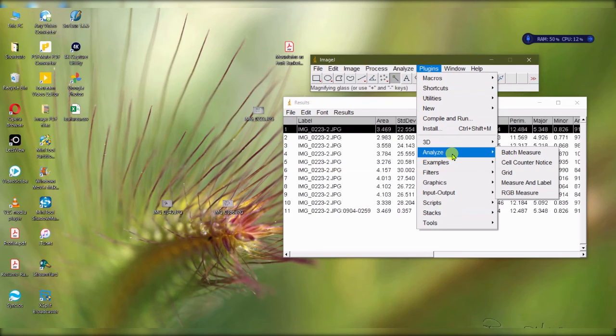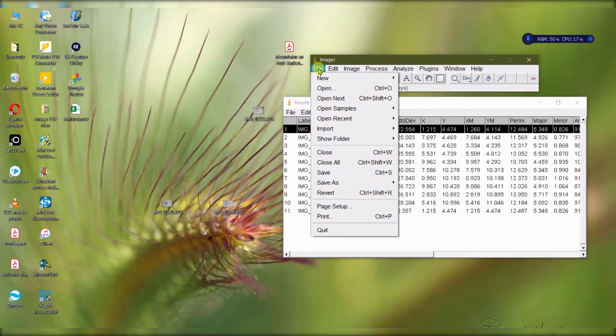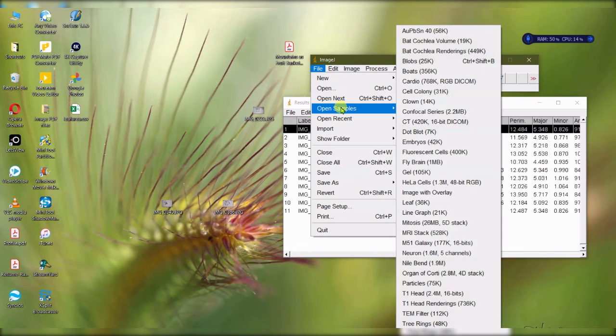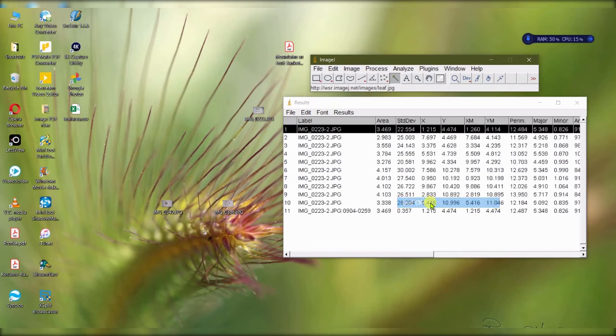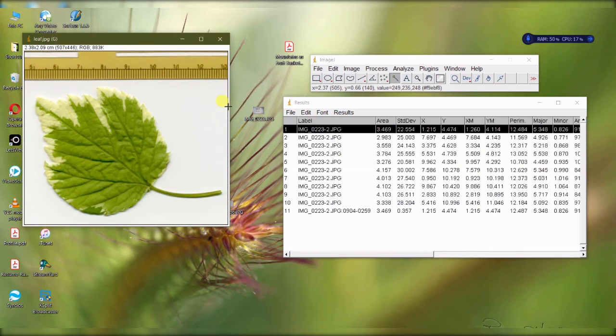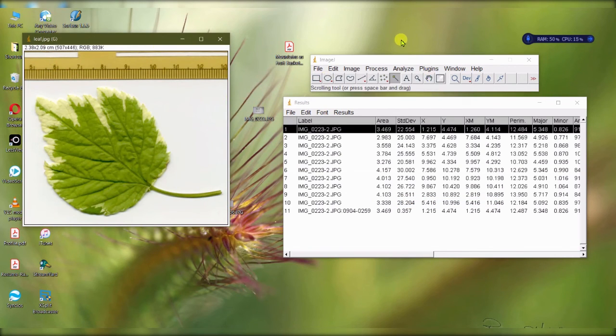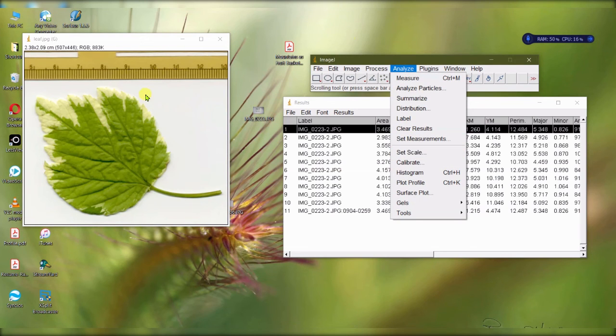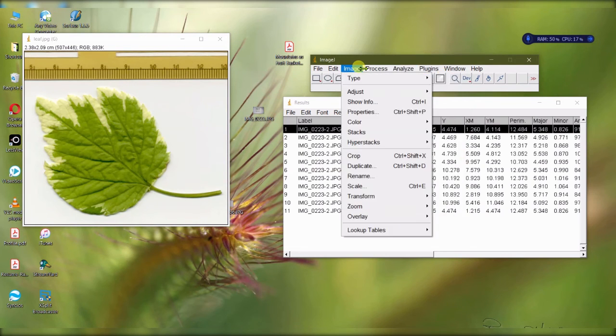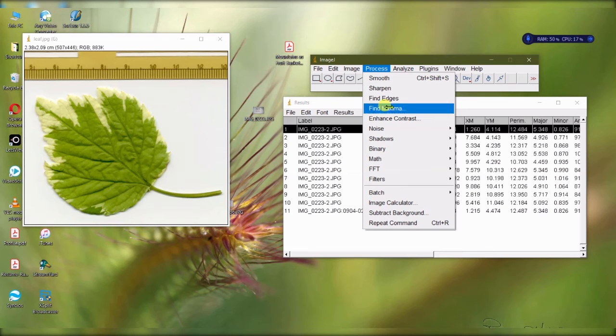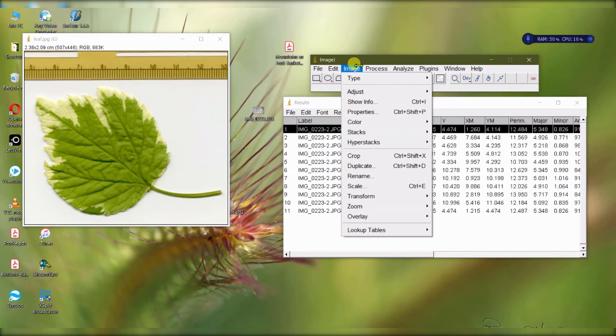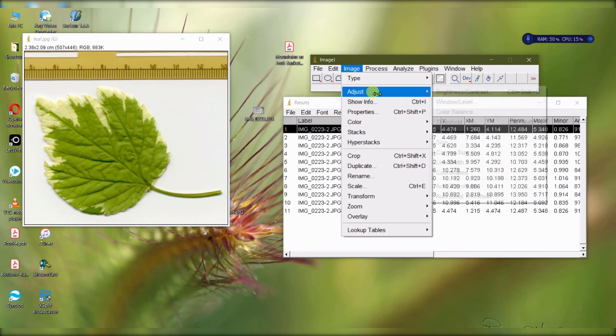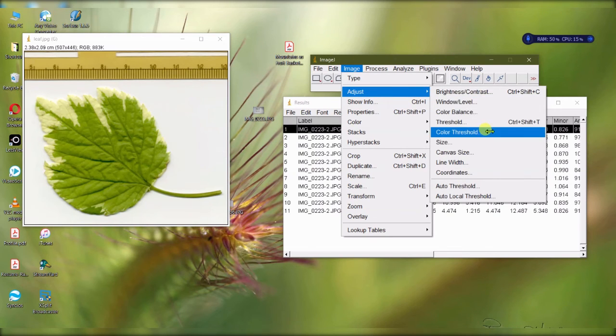I hope this was useful to you. Try it on your own. As I mentioned, ImageJ comes with its own samples. Try it on the leaves. First thing: you go analyze, set the scale. Next thing you do is color threshold - adjust color threshold.